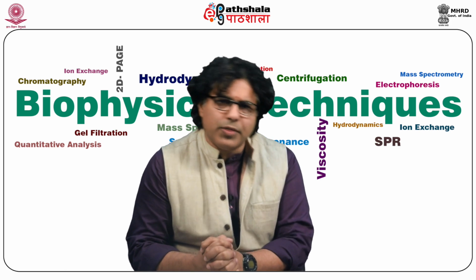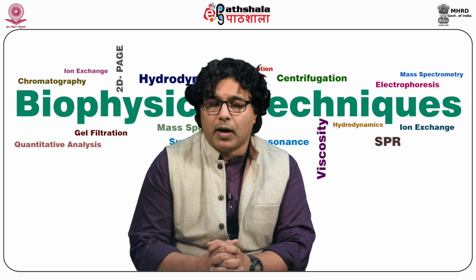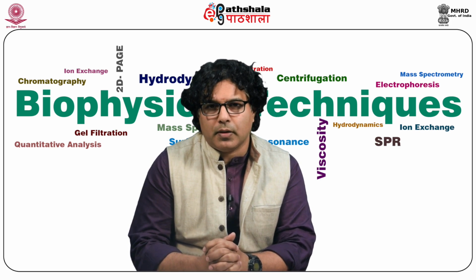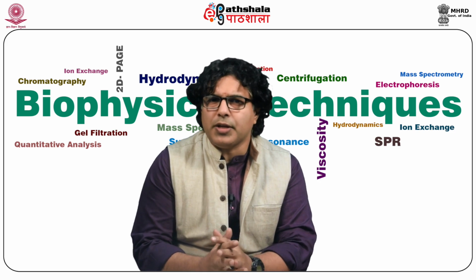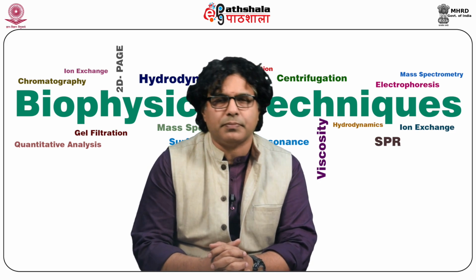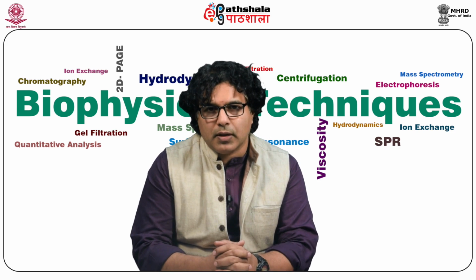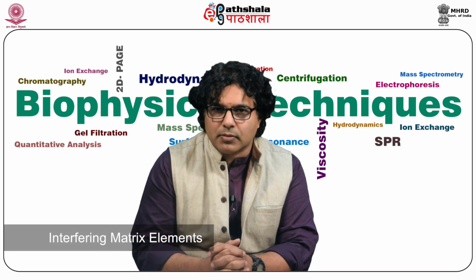Well, sample preparation methods in HPLC analysis is a very interesting field, and it is a very complicated field. So all the more important is that whenever we are trying to develop a method for sample preparation, there are several factors. The important factor is removing the interfering matrix.